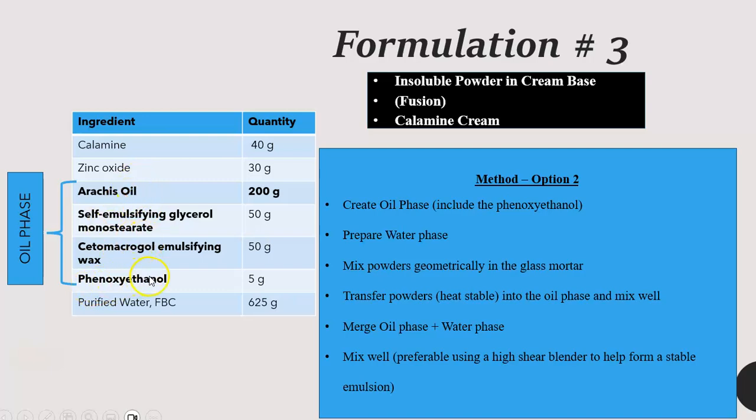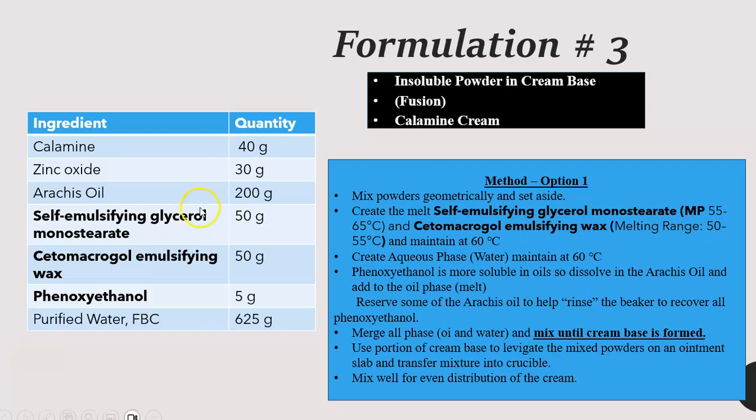So even though phenoxyethanol is the preservative, it is compatible with the oil phase, unlike chlorocresol, where we dissolve it in the water phase. So in putting a sample method together for this, I really had to think carefully about doing this PowerPoint. So let's look at the principle.